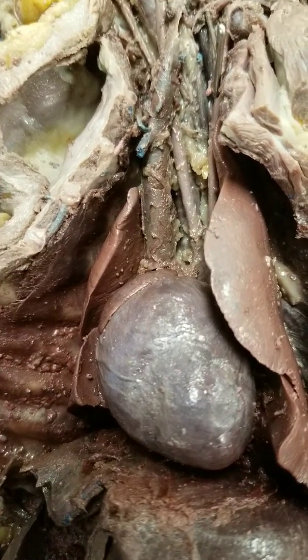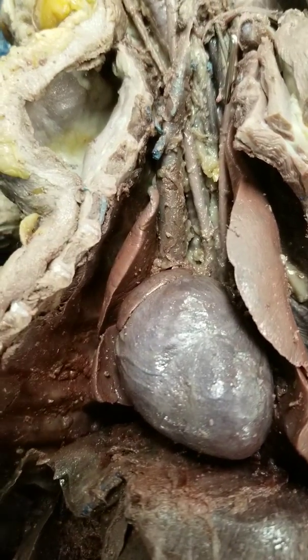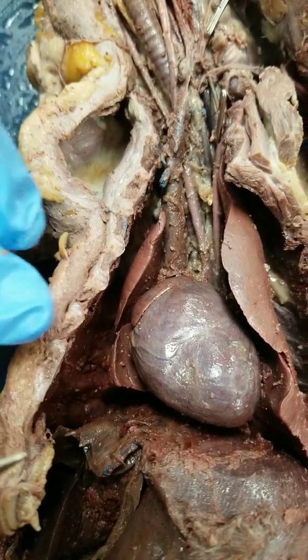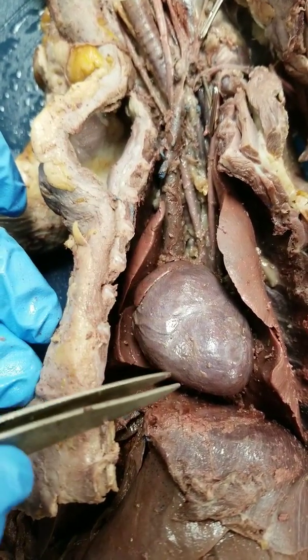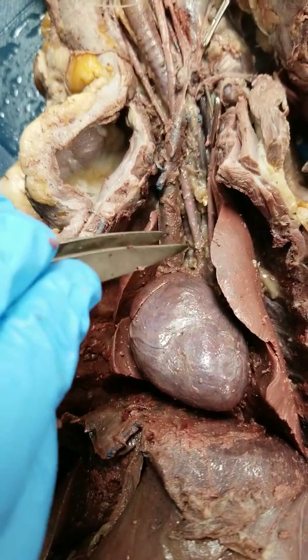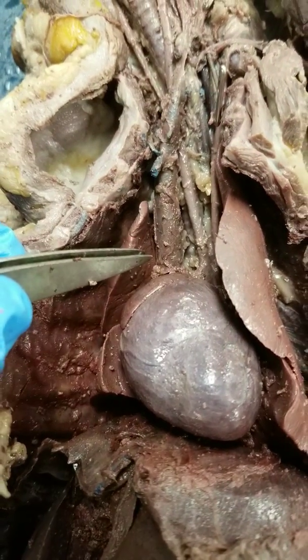Today we're going to dissect the thoracic cavity and the blood vessels of the mink. I've already cut open the chest cavity. When you cut it open, you're going to want to use your scalpel but make shallow cuts and be very careful because you don't want to cut through the heart or any of these really precious blood vessels that are underneath it.